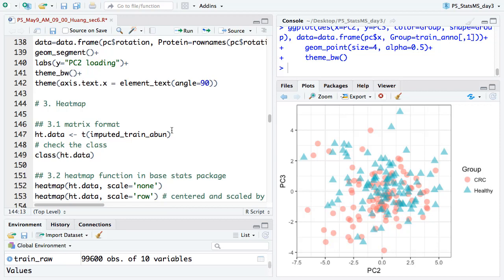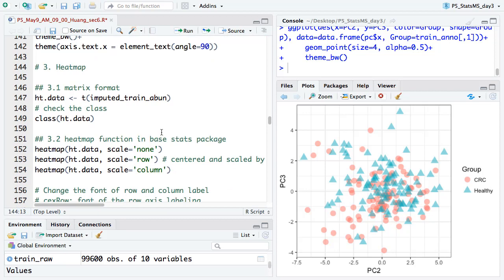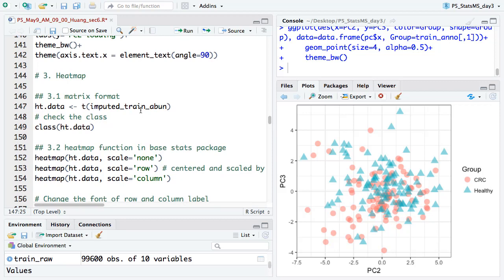At that point, you may want to go back to the loading to see which proteins have the most contribution to the important PC features in the classifier. So you can suggest using this for feature selection — use these proteins to build a model for predicting sample conditions. You may want to look more closely at those proteins with large loading values. Let's proceed to the heatmap section.